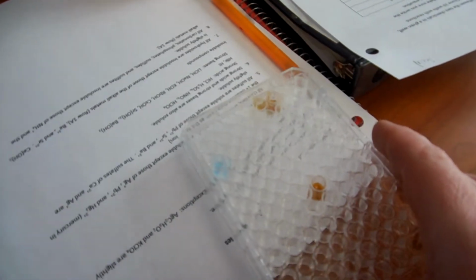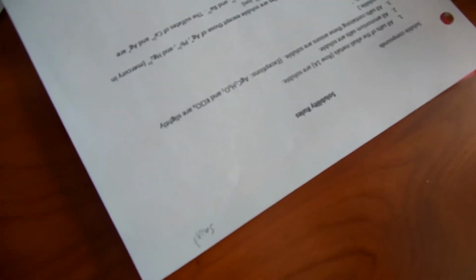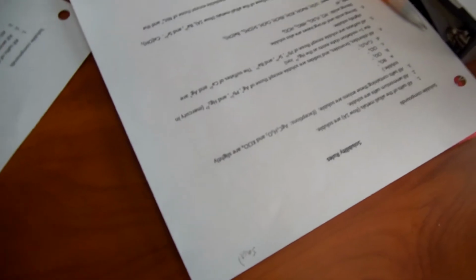Oh, watch. See it darkening a bit? So that's harder to see. Can you see streakiness in it already? Yeah, I can see. It's harder to see, but when you put it on white, it looks cloudy. Woo, that could be exciting. Don't sneeze with the well plate in hand. Now we're starting to see, can you see the blue one has a little precipitate?